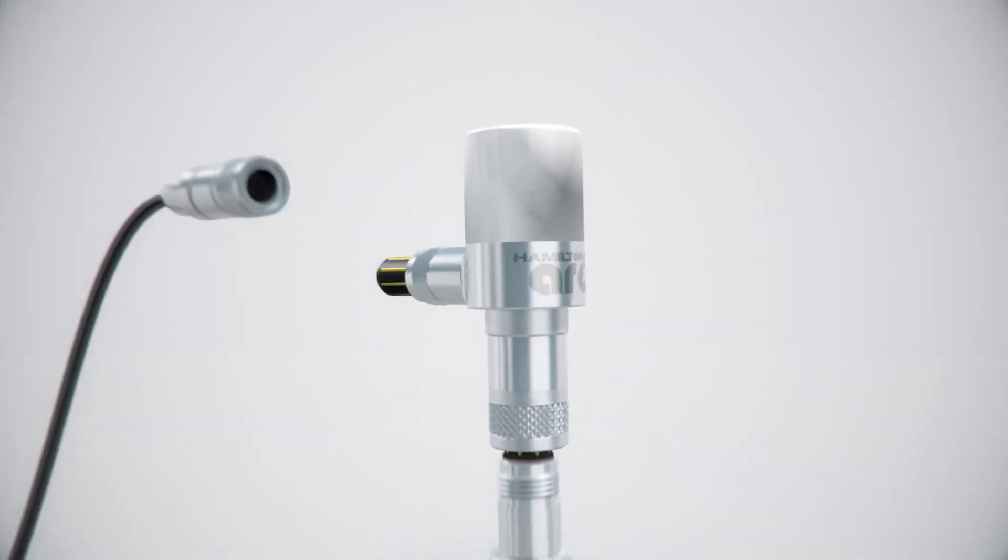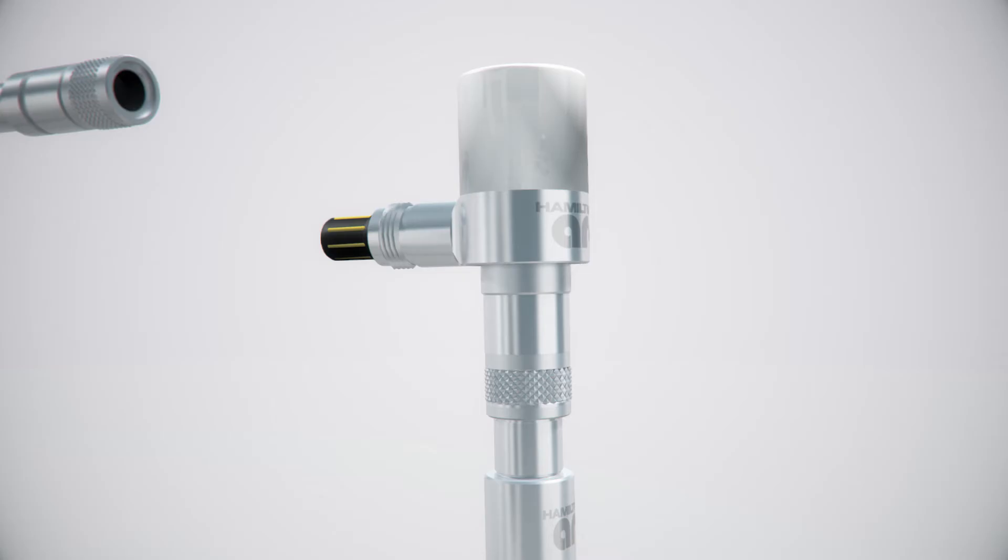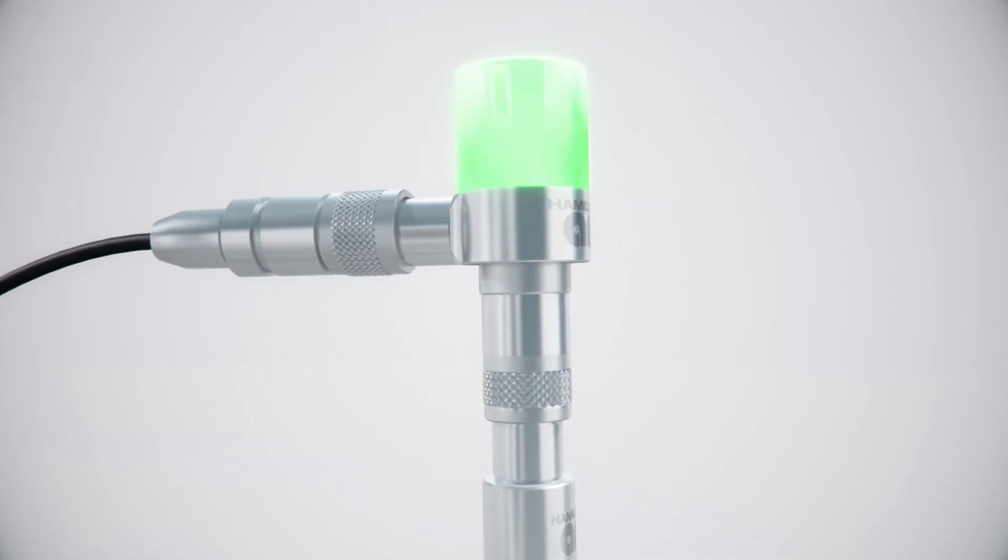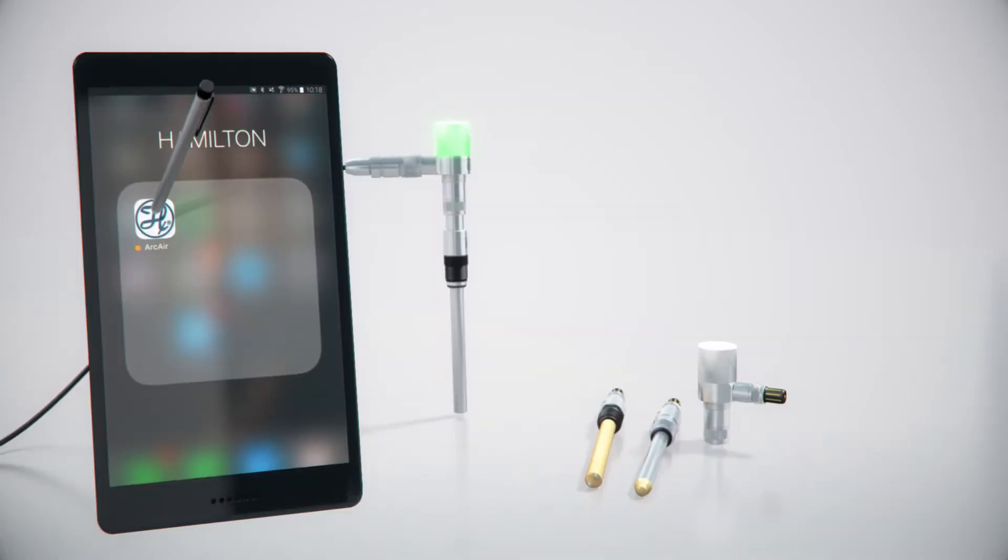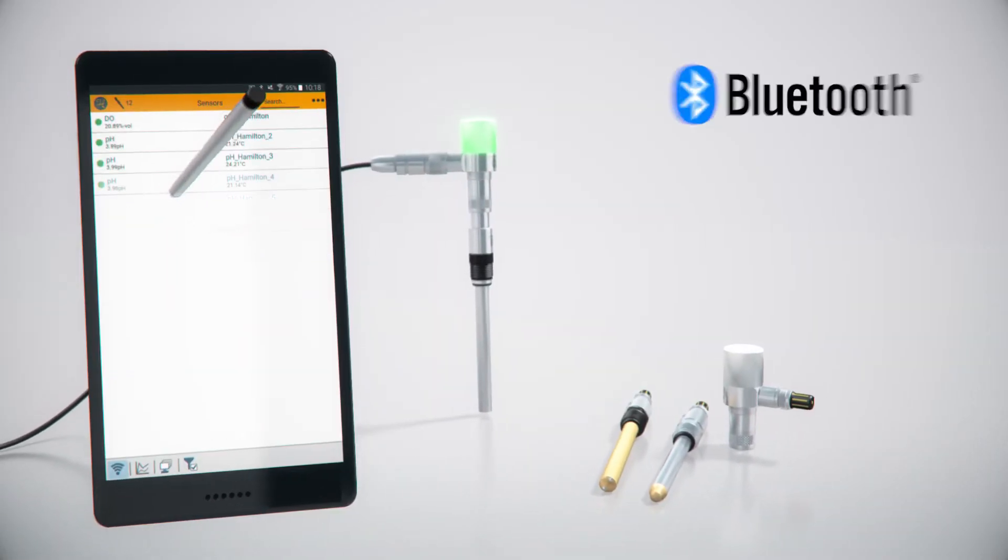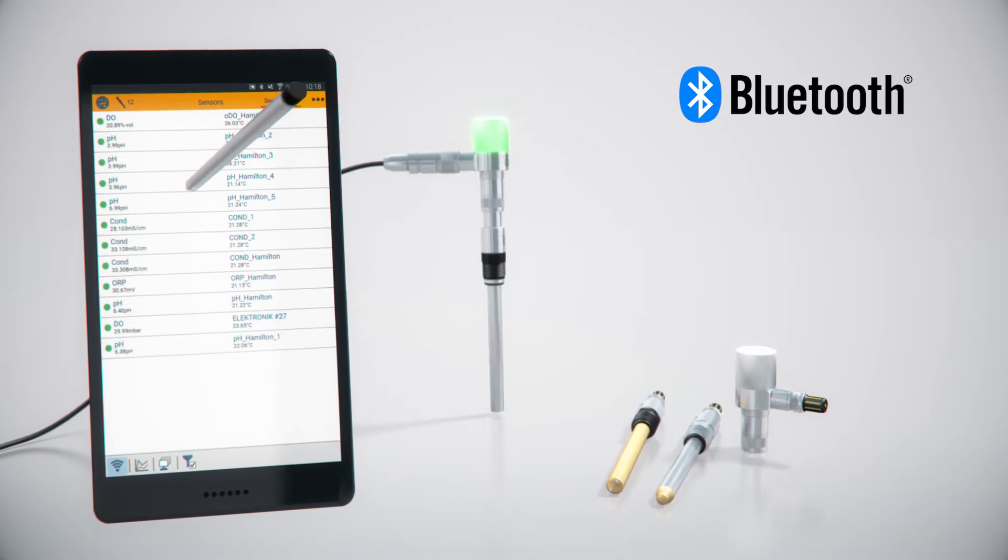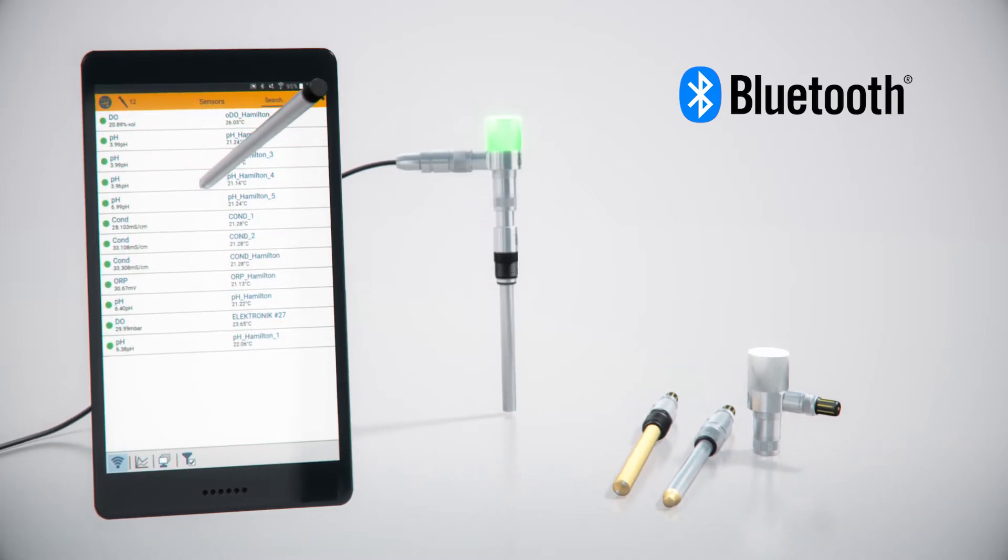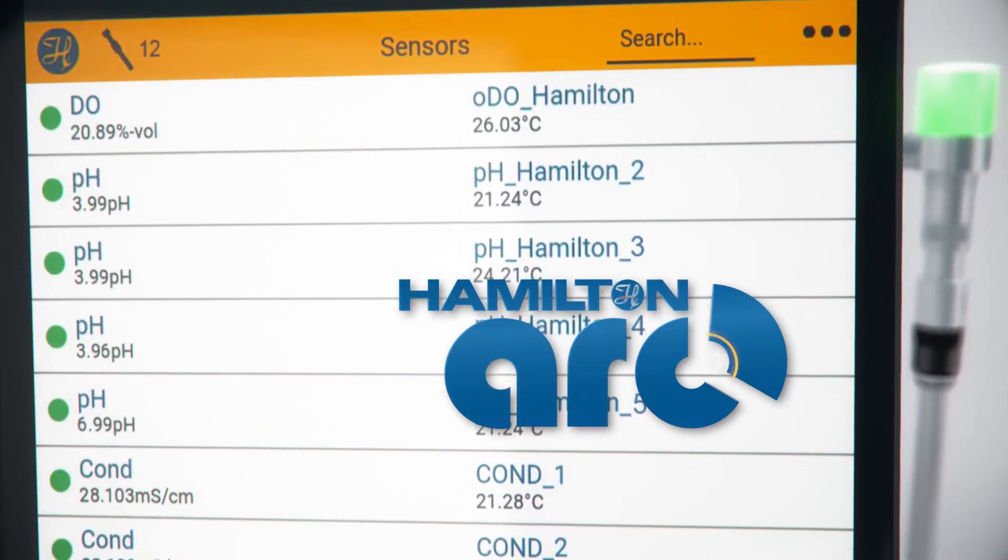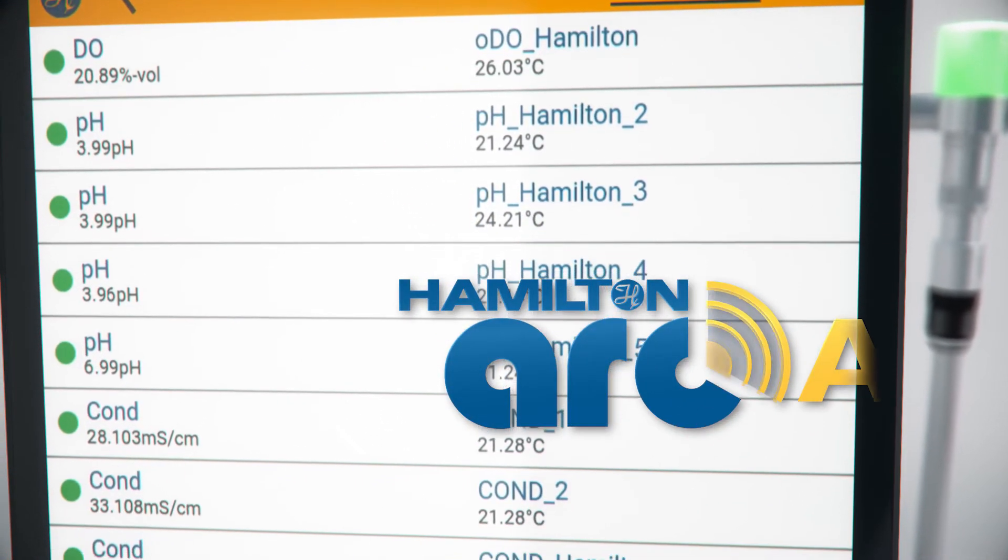Now, Hamilton has provided a simple way to configure, calibrate, validate, and troubleshoot your sensors from your mobile device. This is the new ARC-Air app.